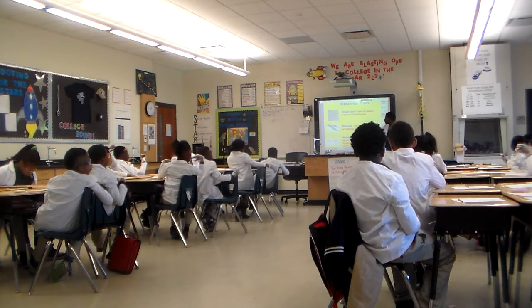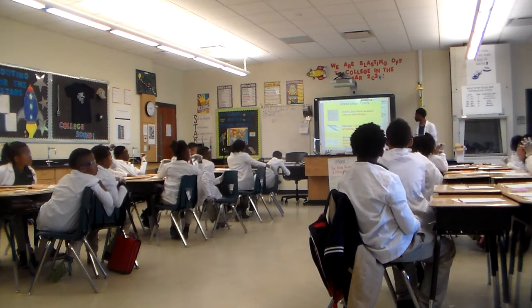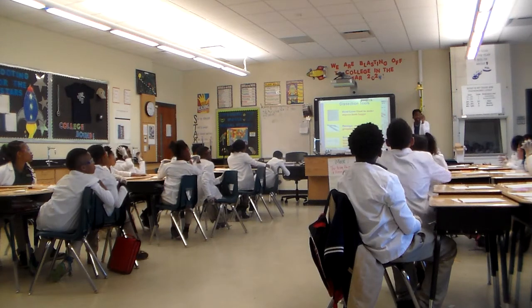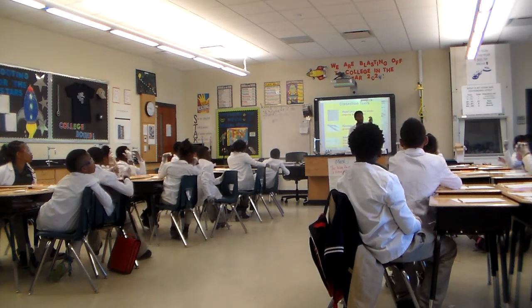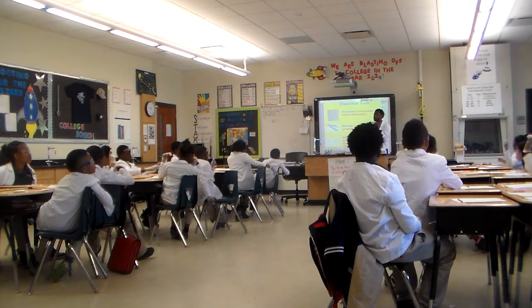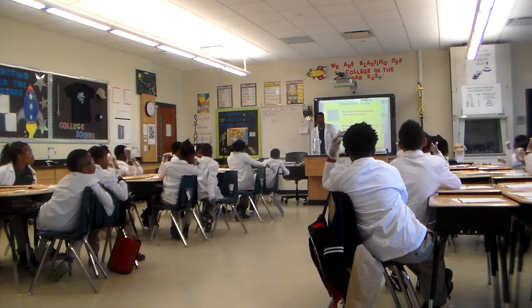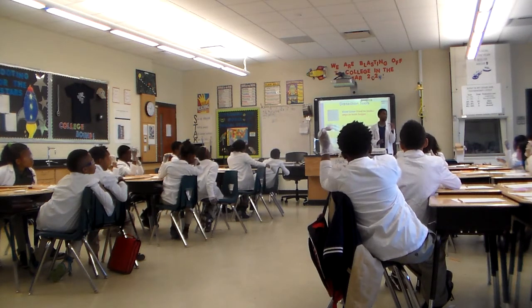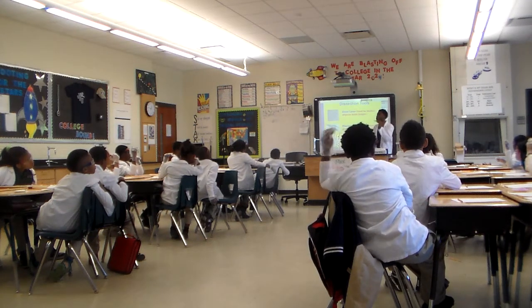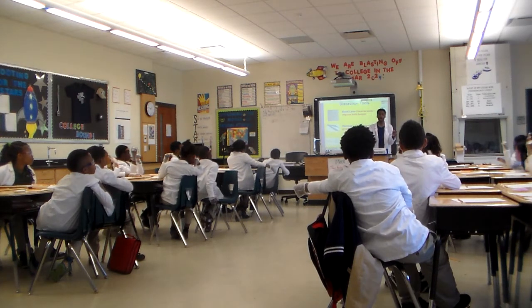You can read the definition straight off the board if you like. Instrument for grasping, holding, running. They're going to be very, very small and intricate parts of your specimen that you're going to want to see, right? And what better tool to use than your forceps or your tweezers, to gently move things around. Because one thing that I want you to realize, when you get your specimen, you're going to have to be very gentle with it, because one wrong move could mess up what it was that you were actually looking for, right?